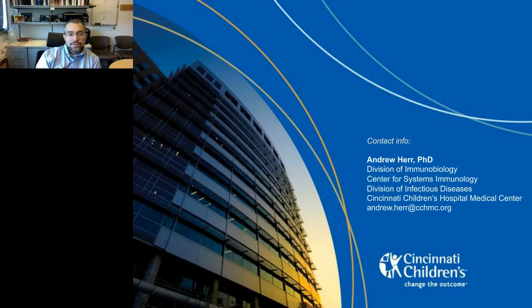The challenges are that everything that is in your solution will give a signal through interference optics. So if you have a buffer mismatch, that can cause all kinds of conniptions when you're using interference optics, whereas absorbance is much more forgiving. If we're getting a lot of samples from outside people and we're not sure how close the buffer matches the sample, absorbance is usually how we will go. Or if we're looking at things like our collagen peptide that does not absorb, it sometimes can be easier to use absorbance at a selective wavelength. So it just really depends on the situation. I think that you can go very far with absorbance only. If you can get interference, it's fantastic because it gives you some other capabilities as well.